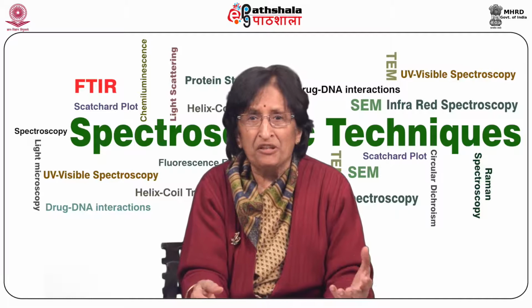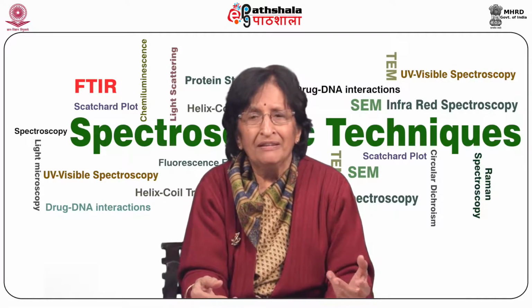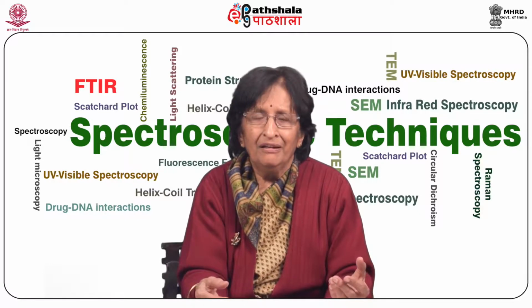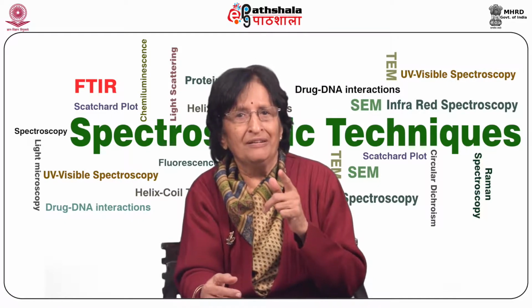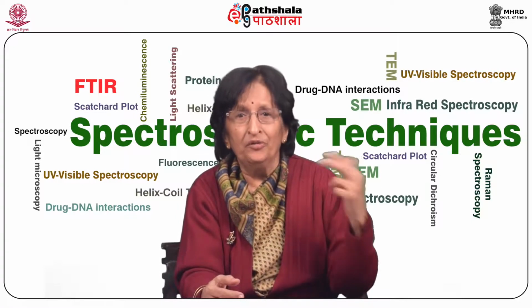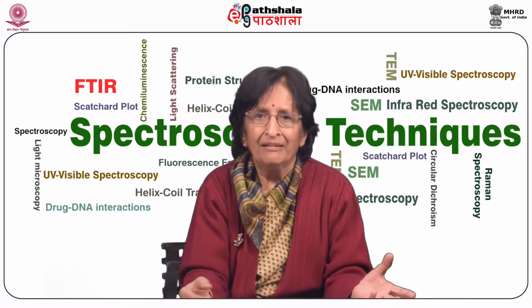The presence of guanidine would also lead to higher absorbance at 260 nanometer. What does it mean? It means if we use 260 nanometer absorption for DNA estimation, it would lead to overestimation of DNA concentration. It will be erroneous.